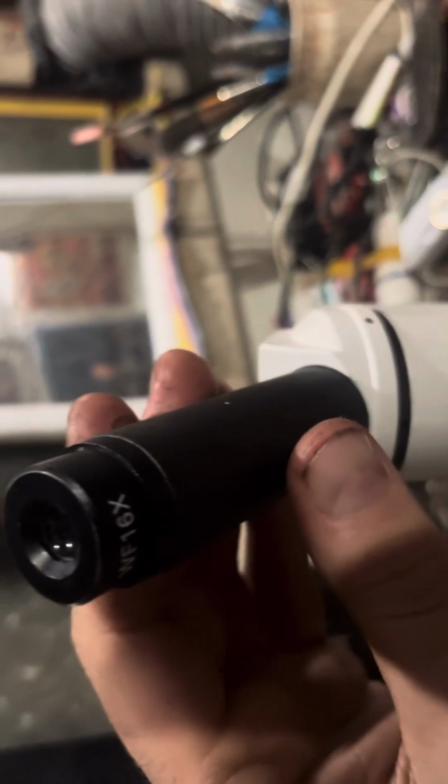So we use 16 magnification for the lens. The only one that I have right here. I had others, but they're in storage, not with me. And we have the stereo objective lenses, the 4, the 10, and the 40, I think. Yes, I mostly use the 4 because I mostly don't require more. I use 64 magnification, which is the minimum that I can have.